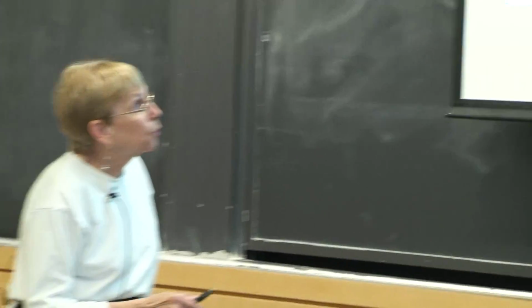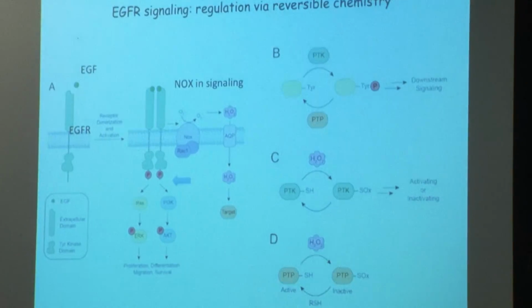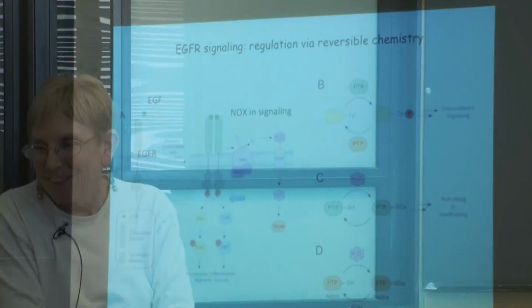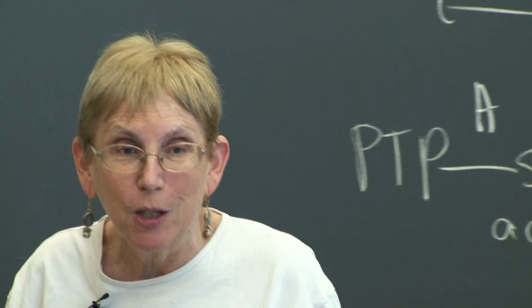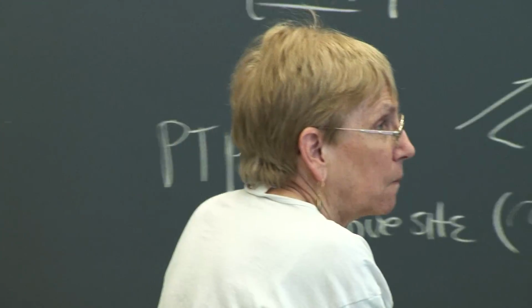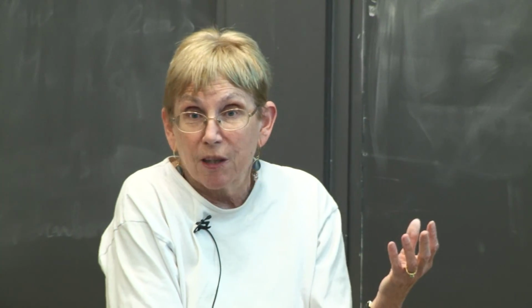And does anybody remember what conclusion people drew about the phosphatase? That was another figure in the paper. There's a lot of information, but in the end, there aren't that many conclusions you could draw. Part of the problem is that I haven't gone over this cascade in the lecture. So I realize that's putting you at a disadvantage, but you've had a couple weeks to read this now. Yeah, so they were differentially sulfenylated depending on whether or not you had EGF present.